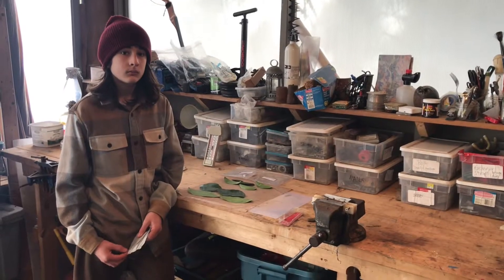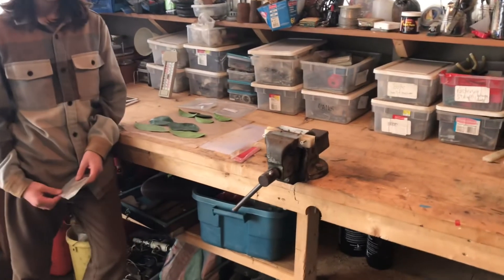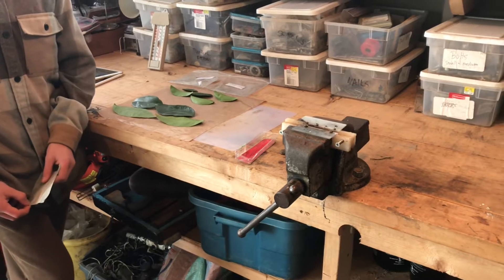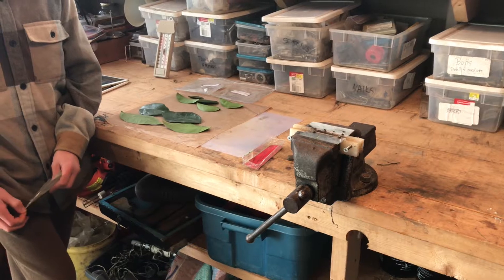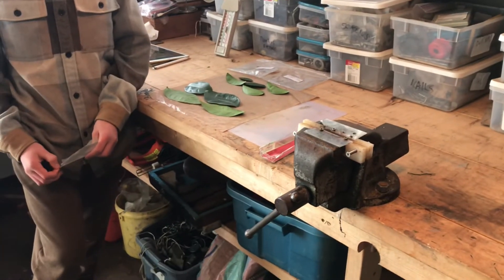We're going to demonstrate here how we get our leaf sap. There's a difficulty getting any kind of sap out of a garlic press, which is what you usually hear people talk about when you're dealing with leathery leaves like citrus and avocado. So we've designed this little system here that seems to work for us.